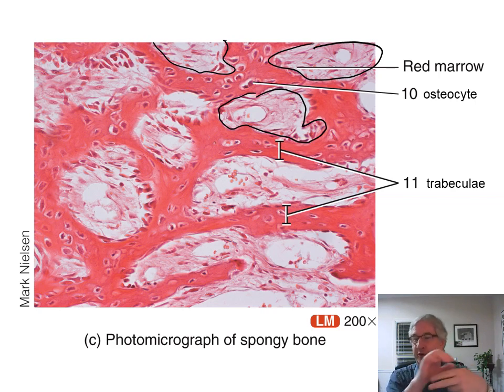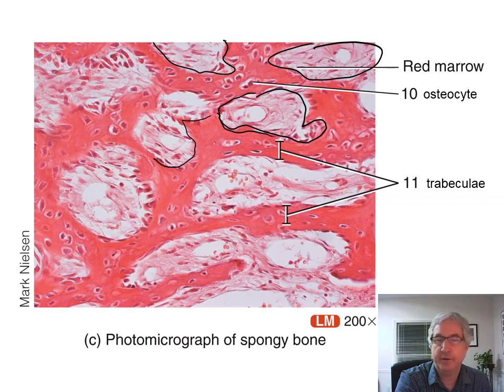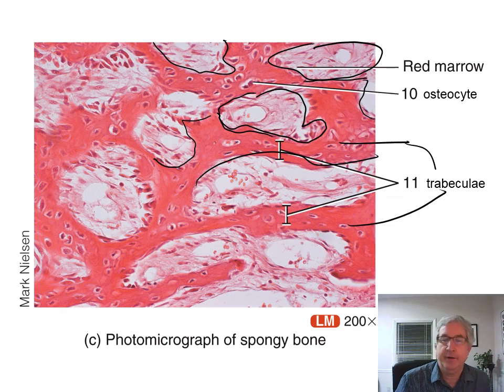You'll see ovals, you'll see long sections, that kind of thing. So here, these are sections through trabeculae. You can see trabecula going through here. So this dark red part is all trabeculae. That's the trabeculae there and here. Okay, next slide.